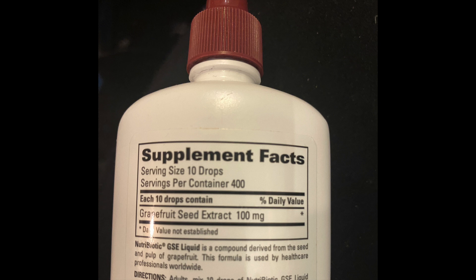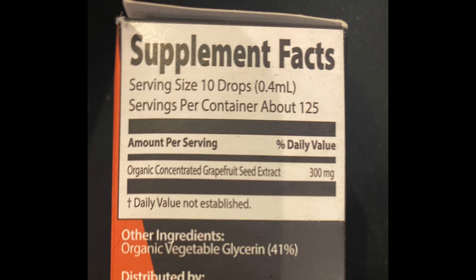So was it the pesticides, or perhaps the concentration of grapefruit seed extract? The non-organic one says it's 100 milligrams of grapefruit seed extract per 10 drops, and the organic one says it's 300 milligrams per 10 drops. So there's actually more grapefruit seed extract per drop in the organic than in the non-organic, so I don't think concentration is a factor here. As for the colloidal silver, I saw a slight inhibition of bacteria — not anything huge, but it's interesting to see that it does have some ability to inhibit bacterial growth on the petri dish.